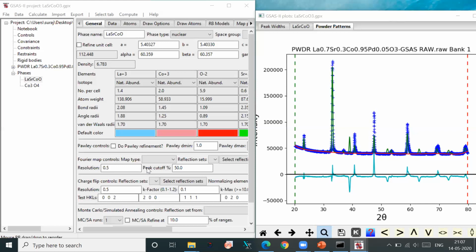Is there any other search engine than the crystallographic database to search? Yes, there are many. One is NIMS; NIMS and MIT have a collaboration with a search engine. It is free. I have it, so I can share it with you. And there is Materials Project. The American Materials Society one is paid, but Materials Project is free, and the NIMS one is also free. Thank you.